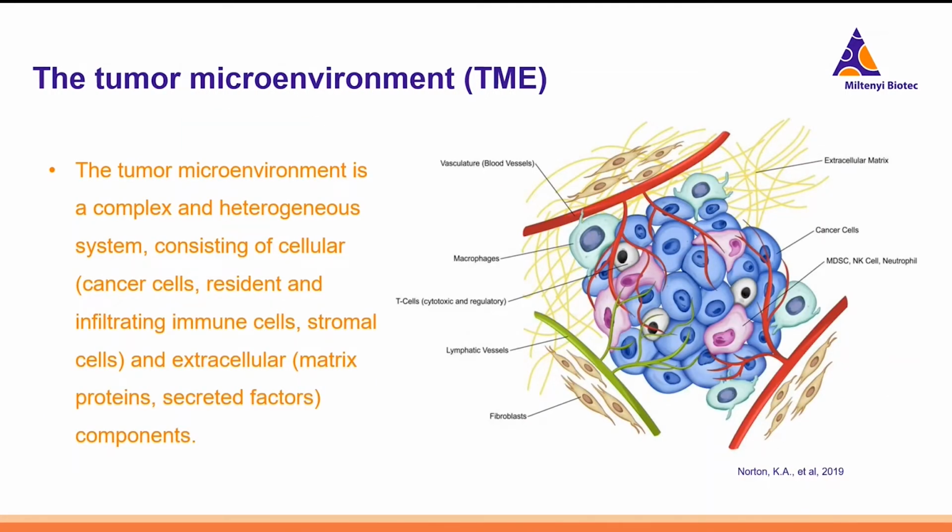Okay, so now I will give you a brief introduction about the tumor microenvironment, and then I will present some application data generated by the MACSima in cancer and TME research. So what does the tumor microenvironment mean? Telma explained it a little bit.